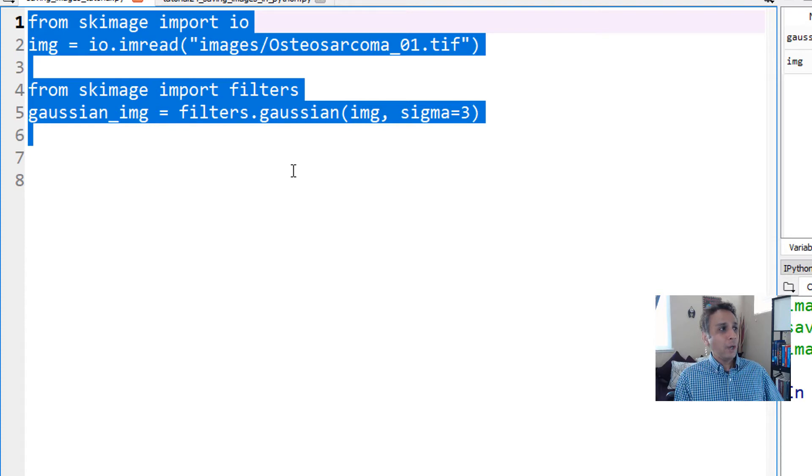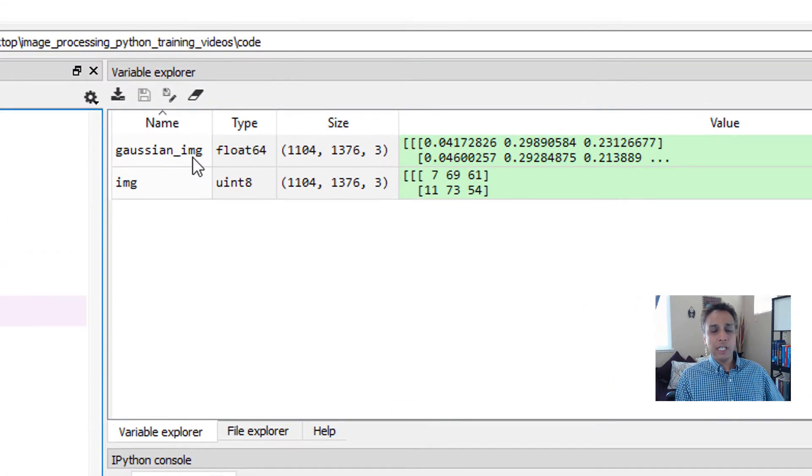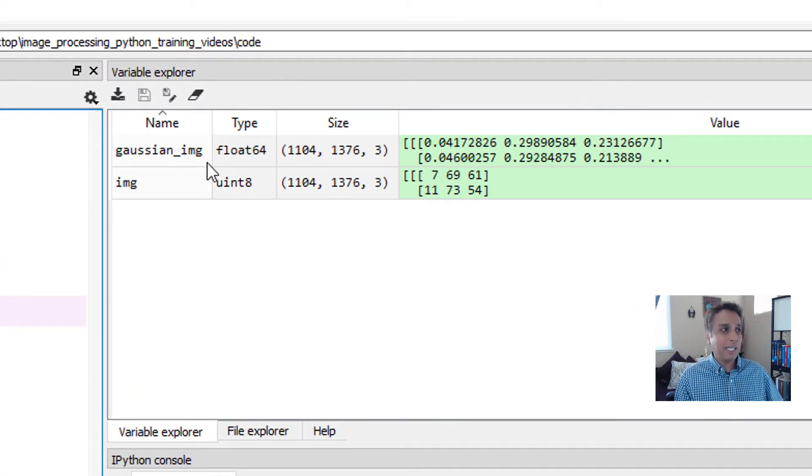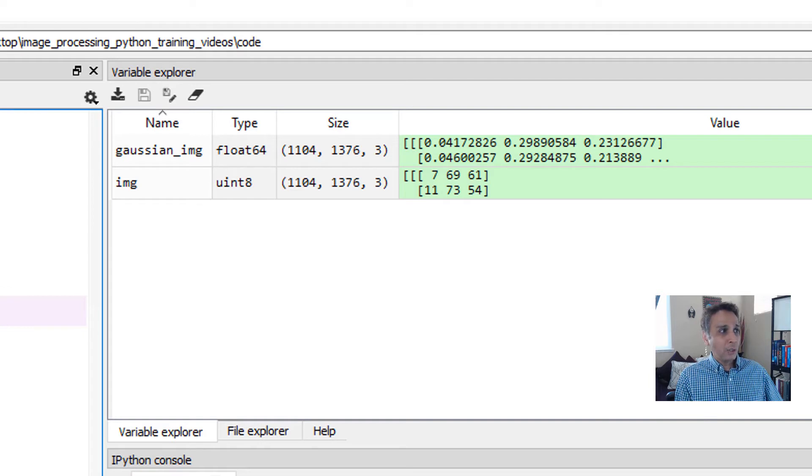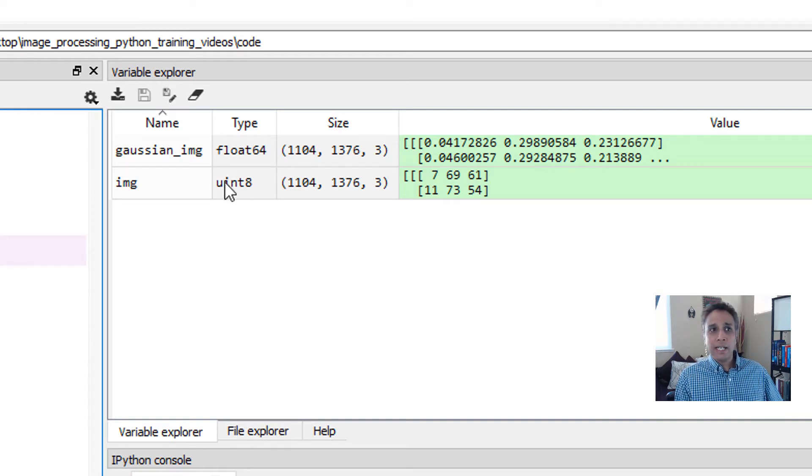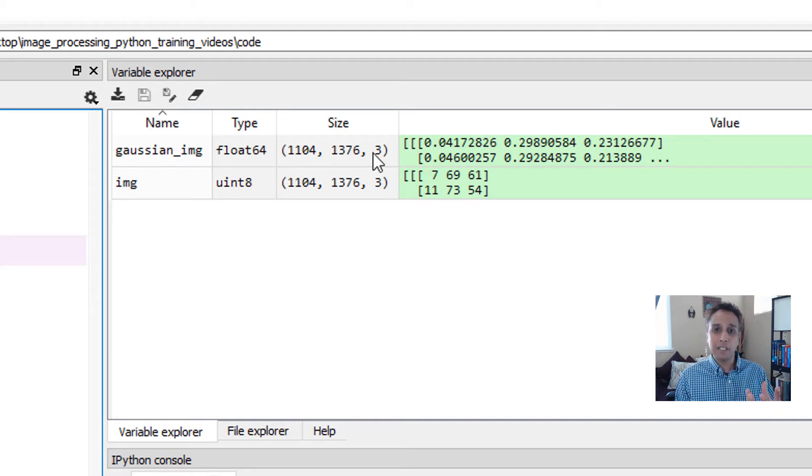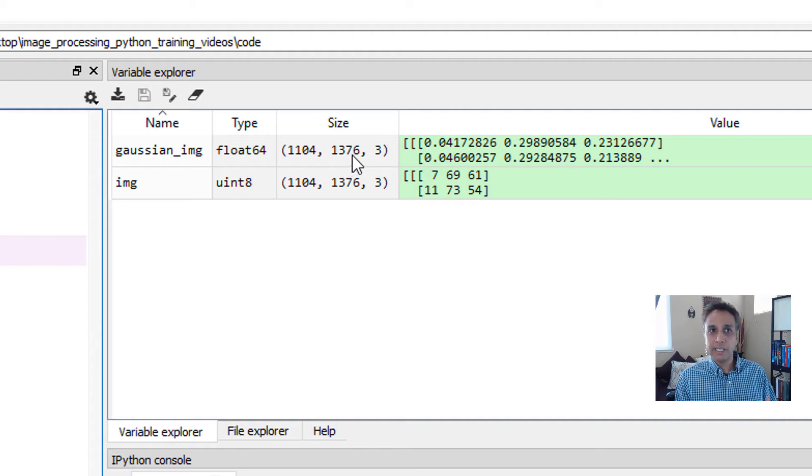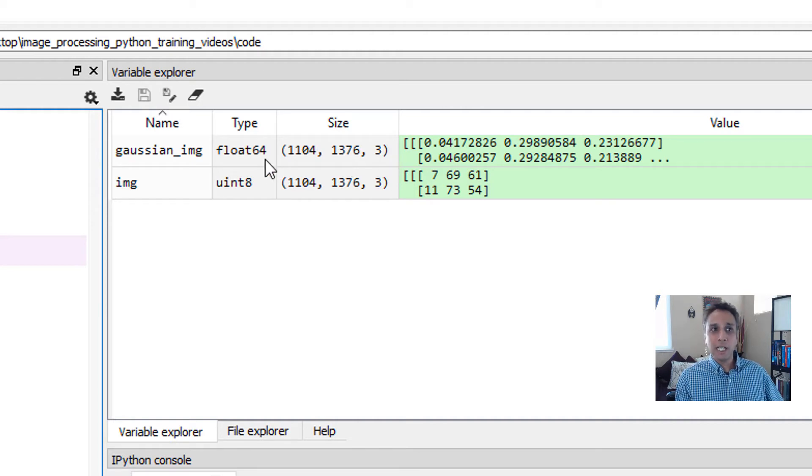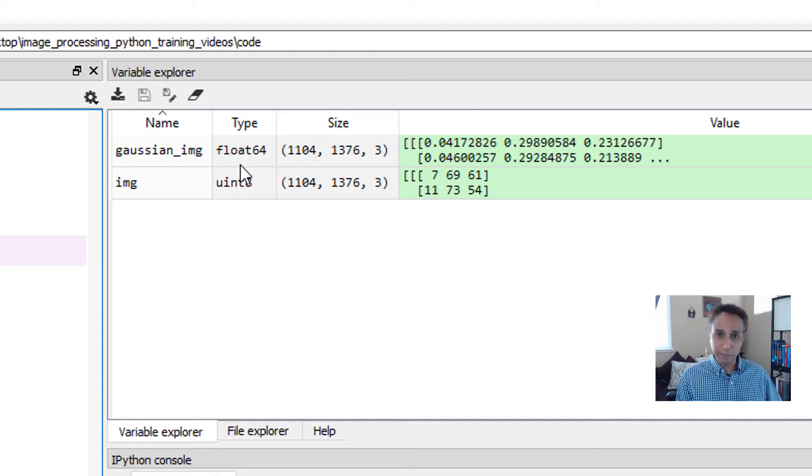Now if you look up here, the Gaussian image output that I assigned to the variable gaussian_img is a floating point number. The size is the same - 1104 by 1376 by 3 - but the type changed from unsigned integer to floating 64.